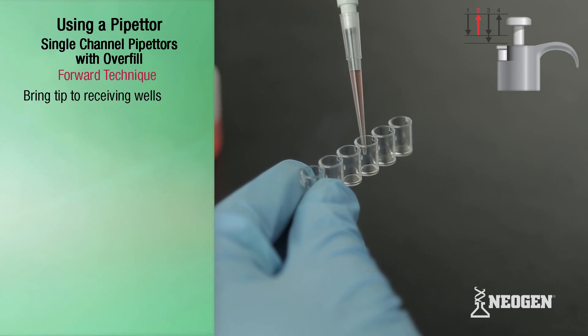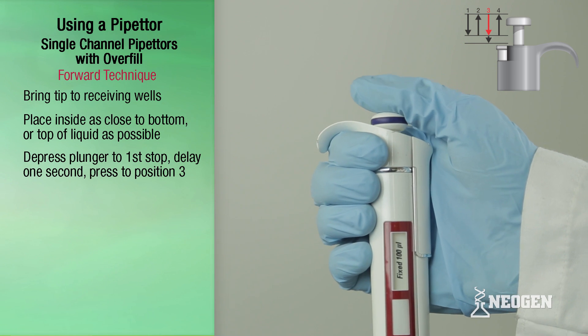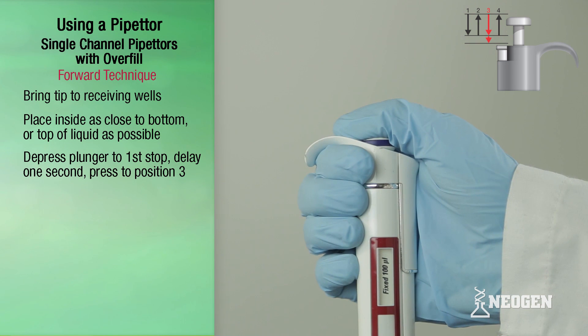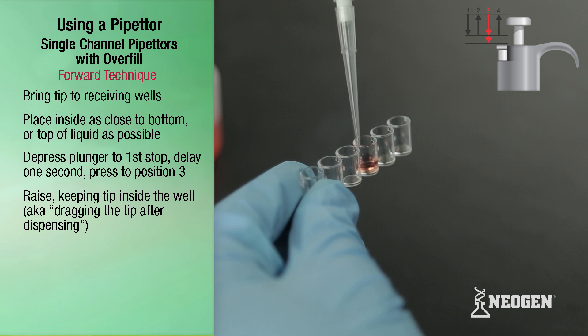Bring the pipetter with the filled tip to the receiving well and place the tip against the inside wall of the well as close to the bottom, or as close to the top of any existing liquid, as possible. Slowly depress the plunger to the first stop. After a delay of one second, depress the plunger all the way down to the bottom of position three to empty the tip. While holding the plunger at position three, slowly raise the pipetter while keeping the point of the tip against the inside wall of the well. This is also known as dragging the tip after dispensing.